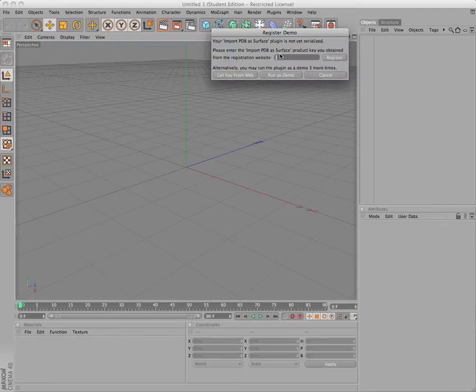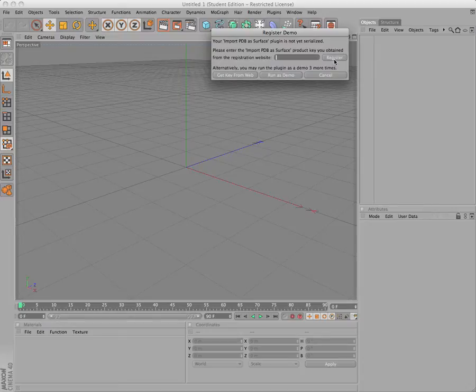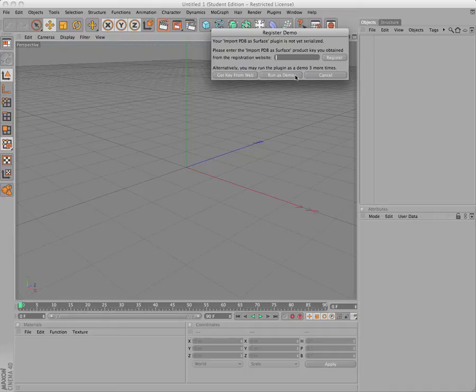The first time you run the plugin, you'll see a registration pop up. You can choose to either register your plugin or run it as a demo. The demo will expire after three uses or 30 minutes after the first use. We'll register by copying and pasting the key code from the email we received.